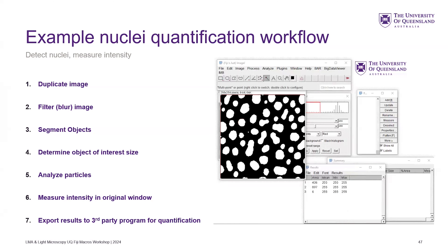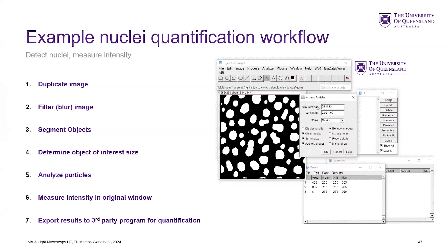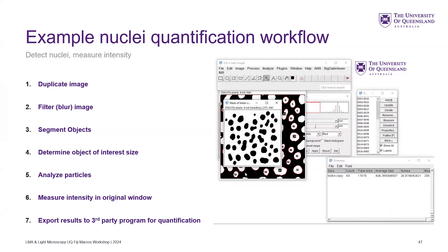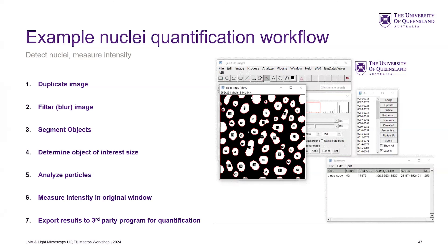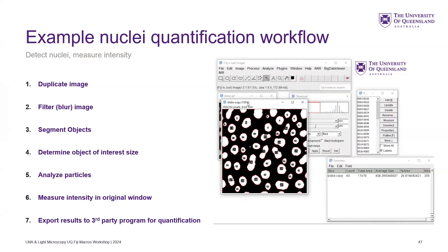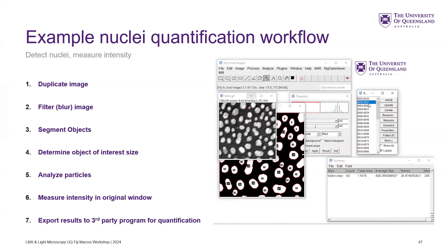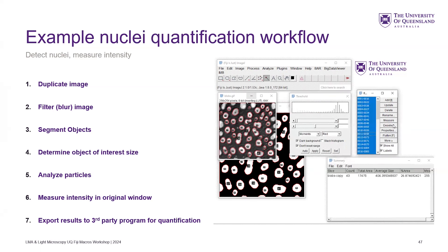That's a little bacteria or something that I don't want. So now I know my rough range of what I do want and what I don't. I bring up Analyze Particles and I don't want zero to infinity — I want something like 50 to infinity, because I know that 50 will exclude the little things and keep only the big stuff. And now I've got these, and it exports. I measure all the stuff and I want to go back to my raw image and actually measure all of the ROIs.